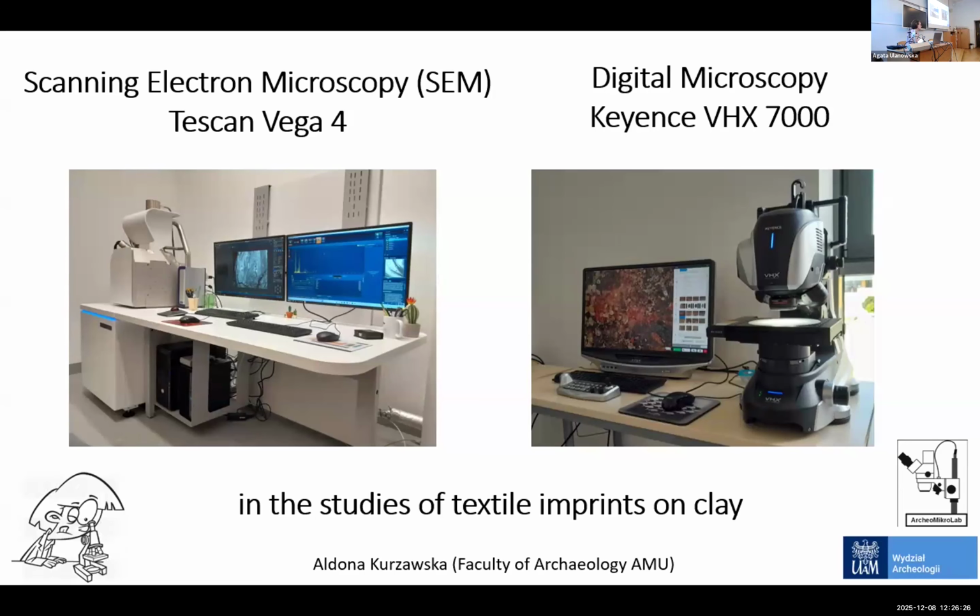I think this is also important because at least in Vienna, we have exactly the same microscope, and also at the University of Warsaw, we have the Keyence microscope, and it has some important functions that might be useful for the analysis.